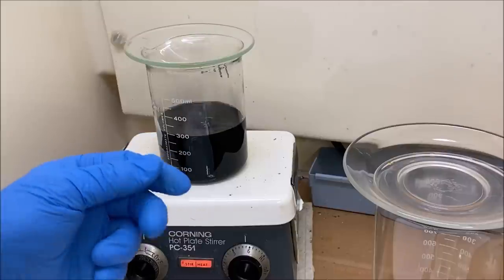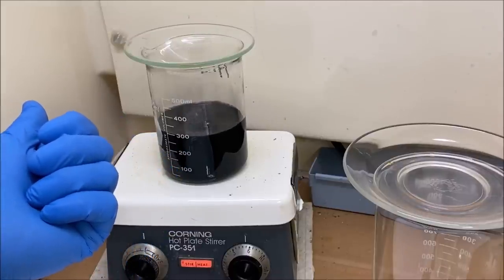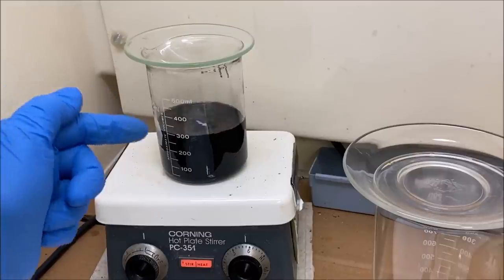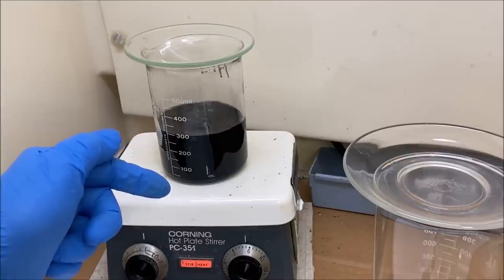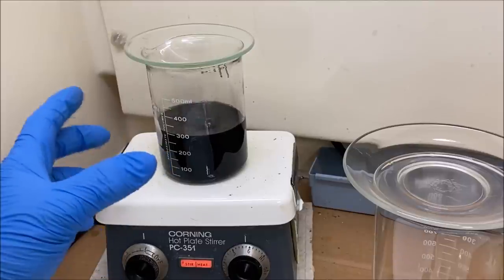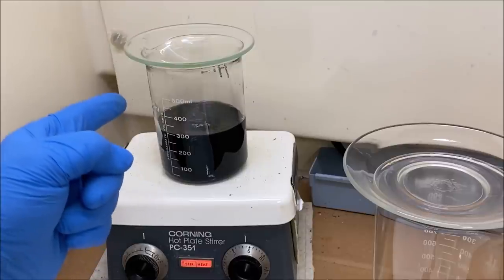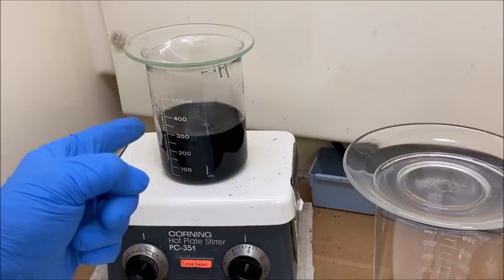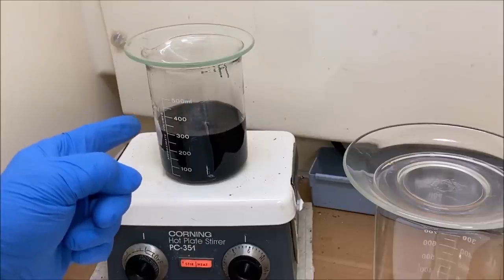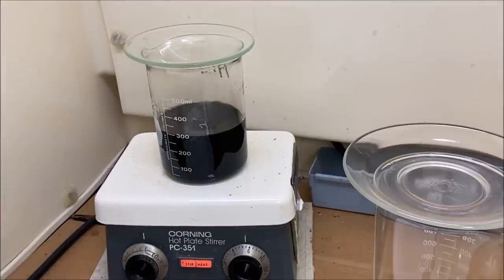What will happen is some of the iridium is going to go into solution with that aqua regia. Some of the platinum is going to stay behind as a black powder and mix with the iridium that didn't go into solution. So there's really no way to get an effective separation just by cooking those black solids in that aqua regia. These metals are so much alike that they tend to follow each other and get left behind, as the case may be.